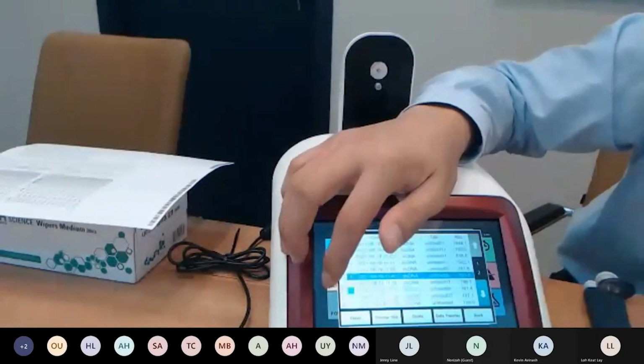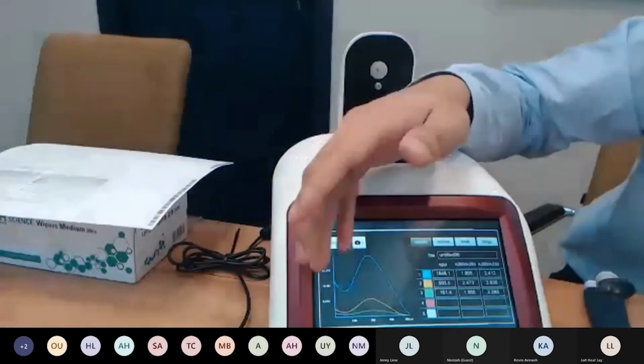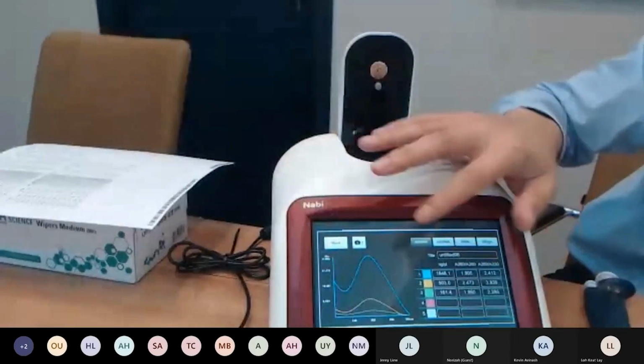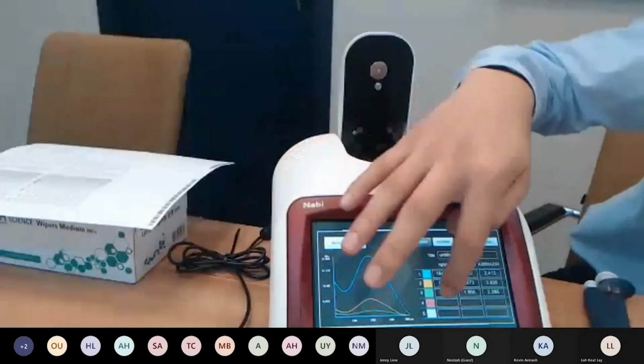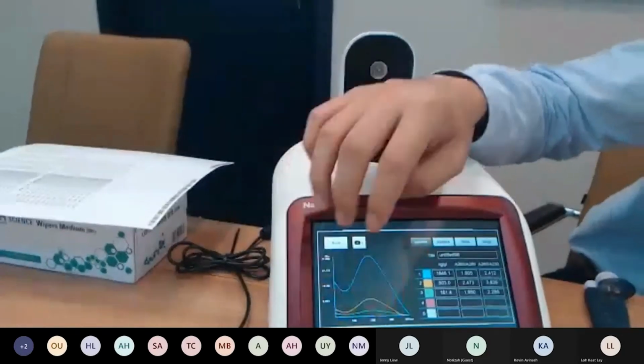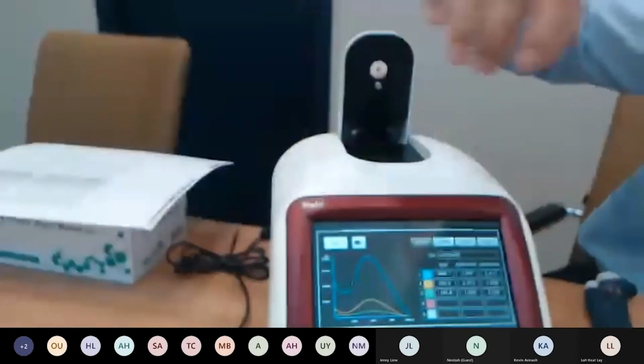If you click multiple ones at once, and if you press detail, you'll be able to see them overlaid like this. So 3 results with 3 different concentrations showing the same looking graph, just slightly squashed for the lower concentration because of the concentration range for the y-axis.